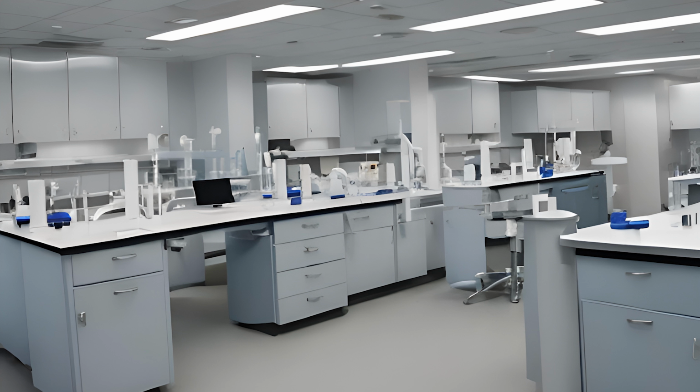In the US, there are several regulatory, private accreditation, state, and federal organizations that will conduct safety inspections in your lab. Some of these safety inspections are unannounced. You are not always going to know that you're going to be having an inspection. These include OSHA, the Occupational Safety and Health Administration.